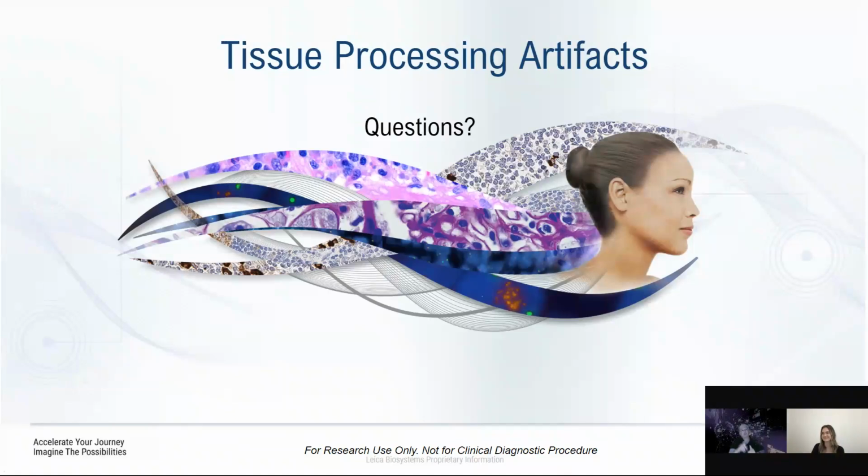With large organs, especially if they're hollow and have a capsule, a lot of times if you're dealing with tumor in a specific area, you need to know that location. We're trying to keep some architecture, right? My experience, as I was also a former PA and did a lot of dissection, is that we would try to open up as much as we could, keep it hinged so it's still together and you don't have a bunch of pieces floating around and you're trying to figure out where that came from or what it was sitting next to.